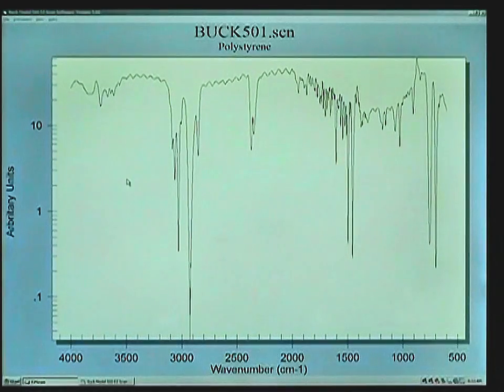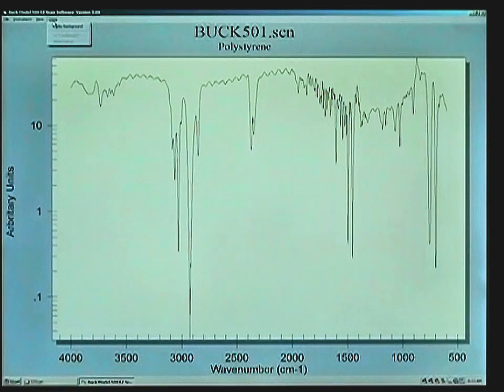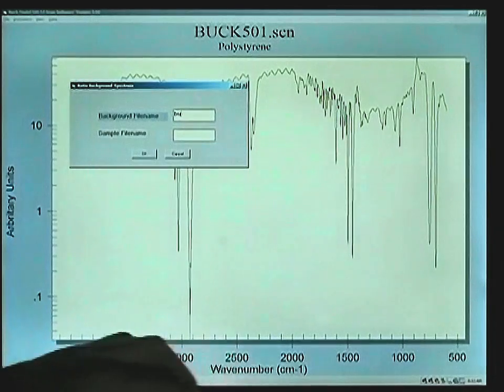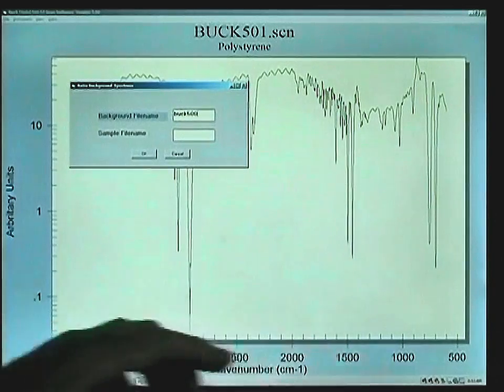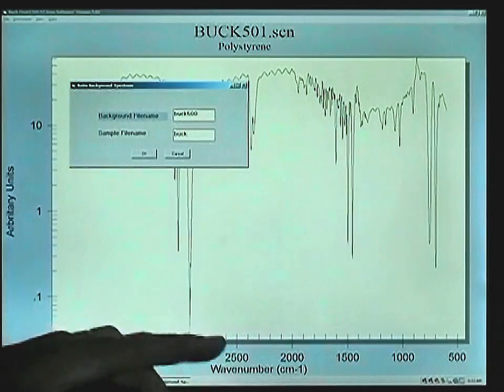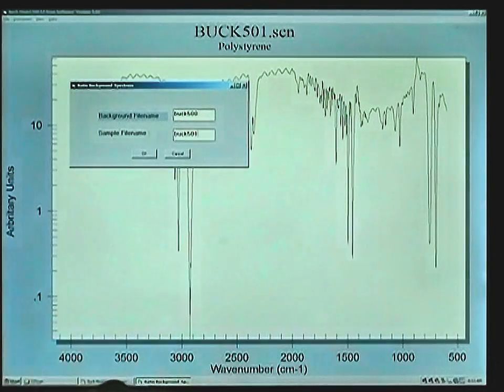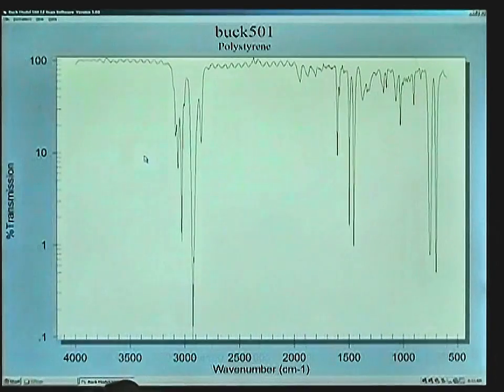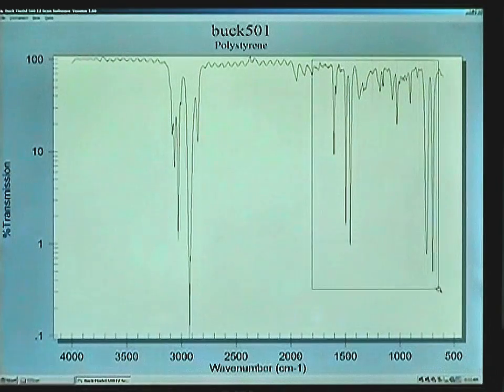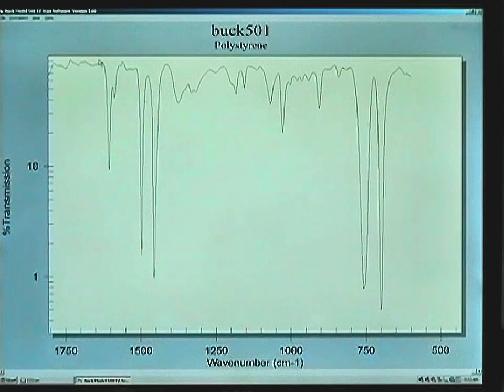With the completed sample single beam spectrum on screen, we can now click on Data, Ratio Background, select the background file name which is Buck 500, our sample file name which is Buck 501, click on OK, and we have our ratio percent transmission scan on screen. We can take advantage of the click and drag zoom feature to expand certain parts of the spectrum.